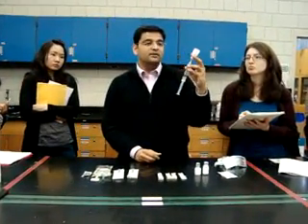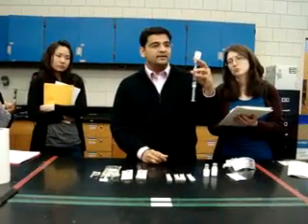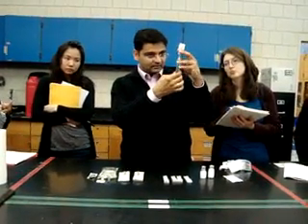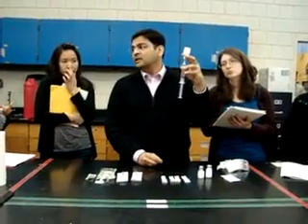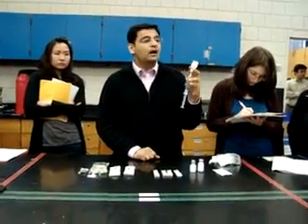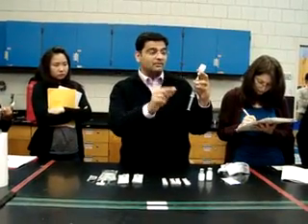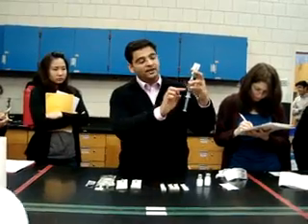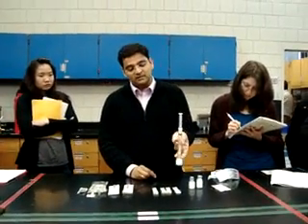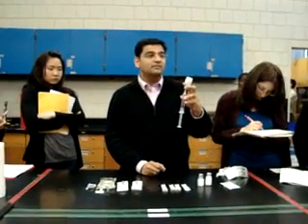Students are often confused about air bubbles. If there are like 3-4 huge bubbles, yes, I would remove those. But if I see maybe 1 or 2 tiny bubbles, don't worry about them — you could tap for a whole year and they still won't come out. To judge which air bubbles need to be removed: if there are huge ones, remove them. Another test is to flick the syringe — if the bubble moves, there is a significant error in the volume. If the bubble doesn't move, there is no error in the volume.